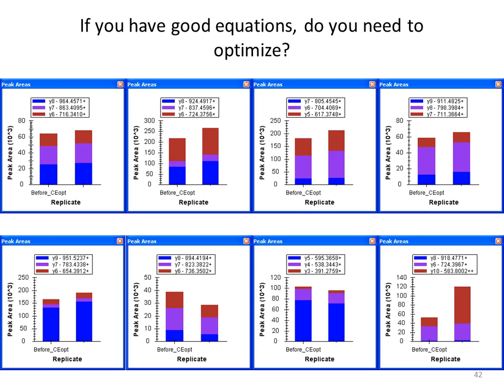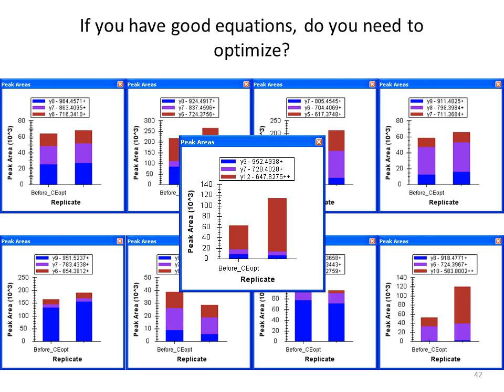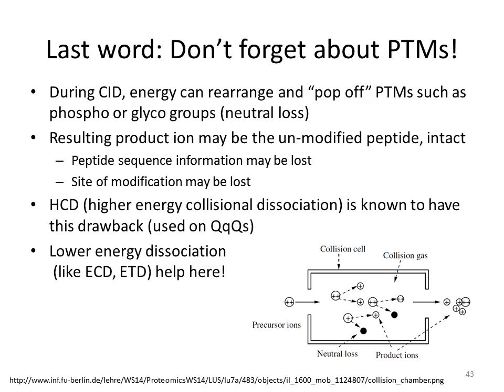And these are a bunch of different peptides, starting with the same collision energy regression and then optimizing them, soup to nuts. This was the only one where we got a significant twofold improvement in that particular peptide. So it's not always necessary, and there is no consensus on whether you should do it or shouldn't.